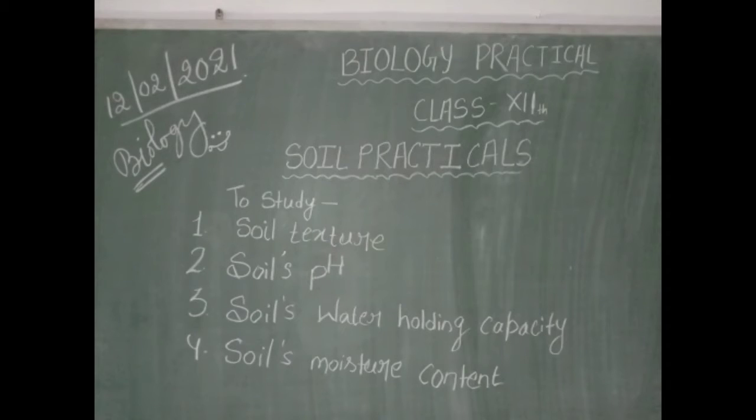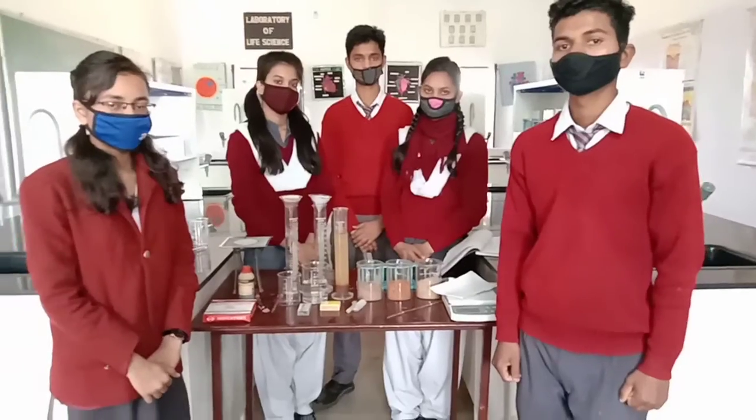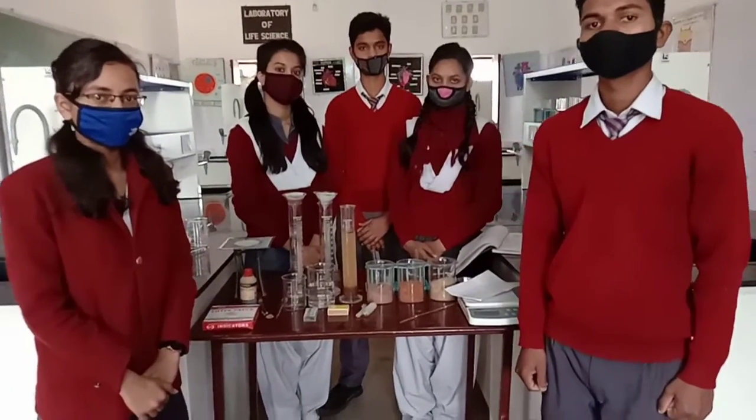Dear students, I hope you have found today's experiment related to soil practicals very easy and very interesting. So, in our experiment, we finally studied the soil texture, soil pH, soil water holding capacity, and soil moisture content. Here we come to the end of our experiment.